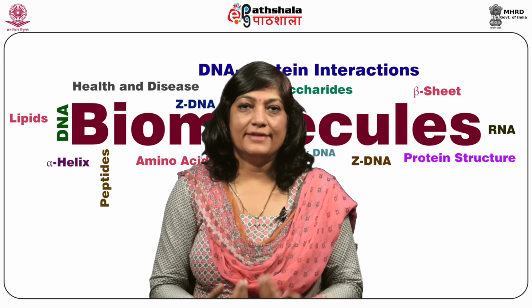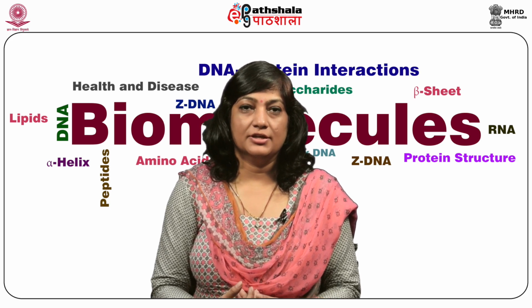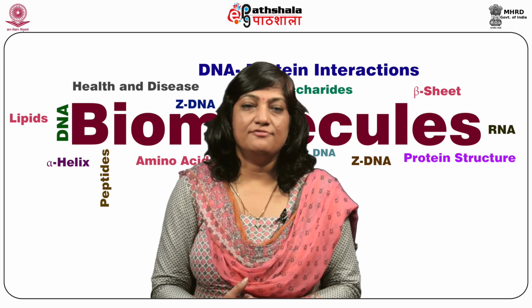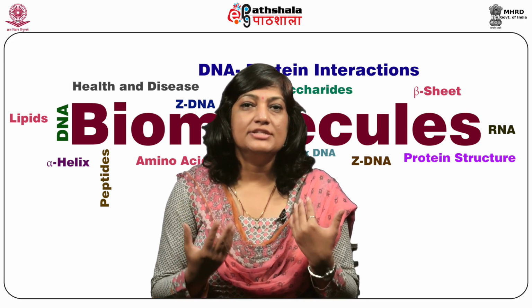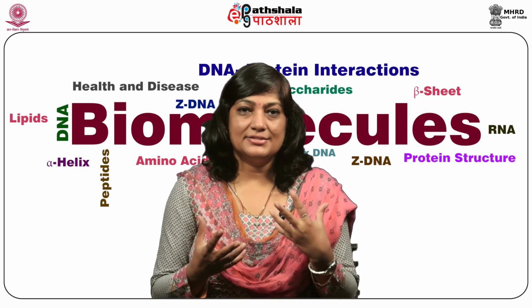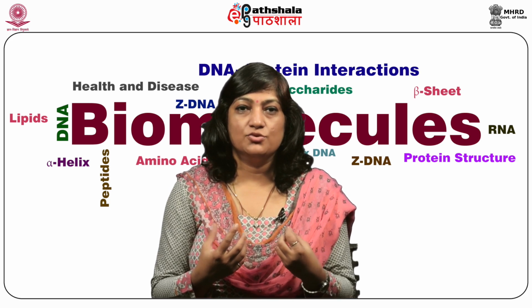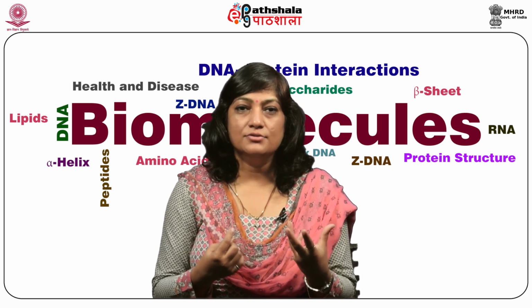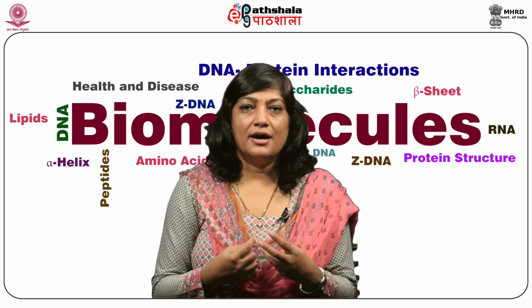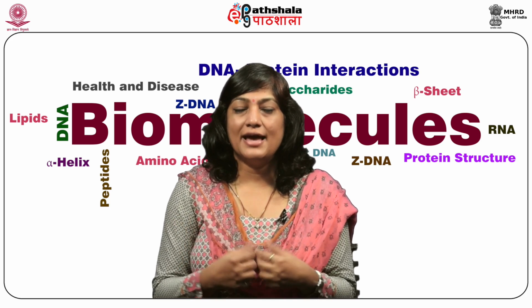So let's have a look at the applications of gas liquid chromatography. As we've already seen, GLC is confined to volatile and nonpolar compound separation. The analytes are characterized by their retention times relative to a standard reference compound or a control. The most volatile compounds are carried by the carrier or the mobile gas, which is the inert gas.